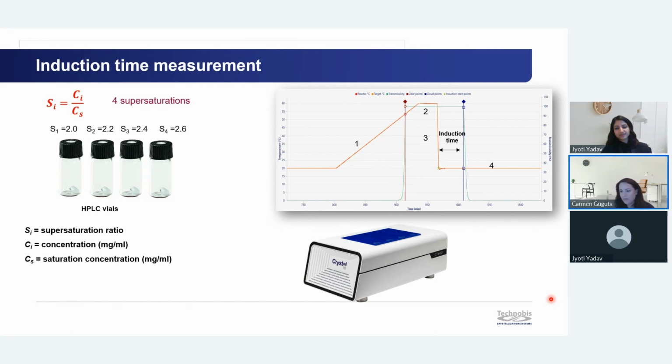The group of Professor Myerson, then also a group of Professor Job ter Horst, Professor Mazzotti, and after a few years, I think they also came back. Even Thomas Vetter, I do recall, had a review, and most of them agreed that they determined a minimum adequate, optimal, let's say, number of cycles would be around 80 cycles, no matter the compound that you are using. So that's why I guess you have done the 80 cycles, right?